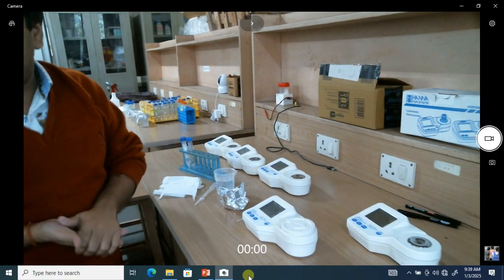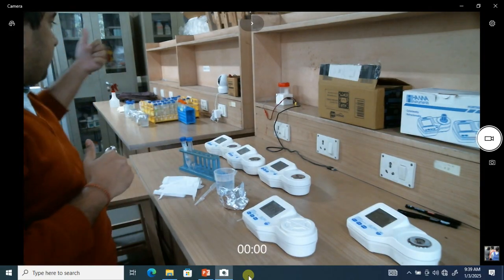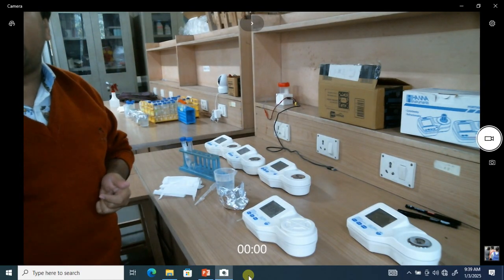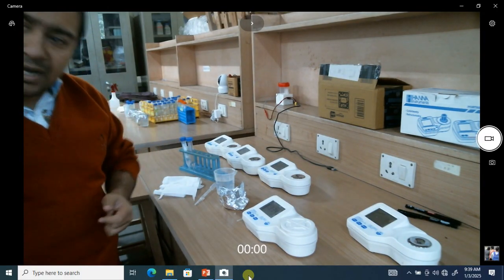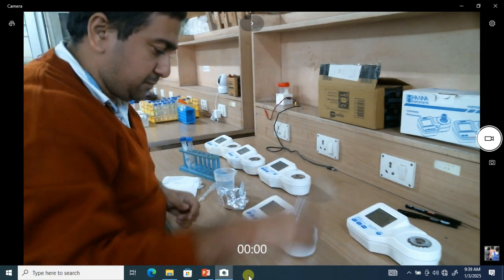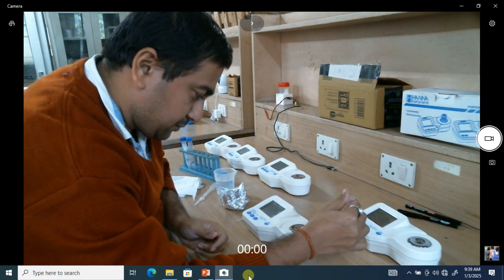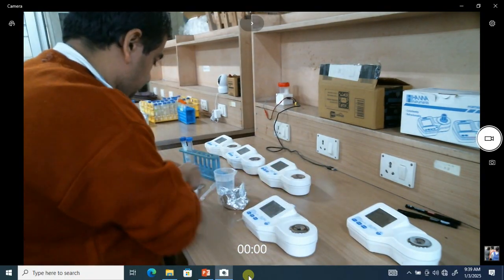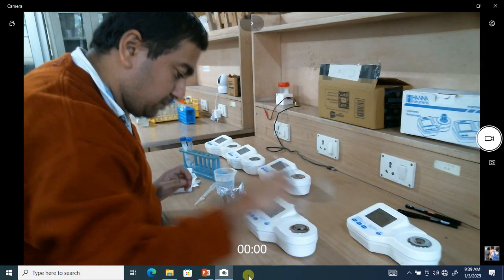Today we will measure both the ND and the ND20 of the samples that we will provide to you. The standard solutions will be given, and each group will also get an unknown sample. From that, I'll show you after the experiment how to plot the standard curve and how to get the unknown concentration from the experiment. So we'll keep it off. That's it.